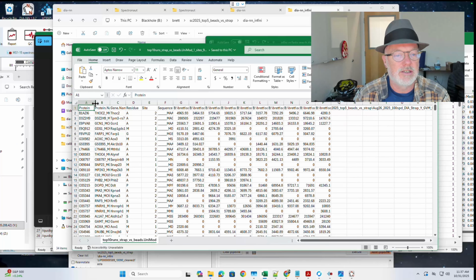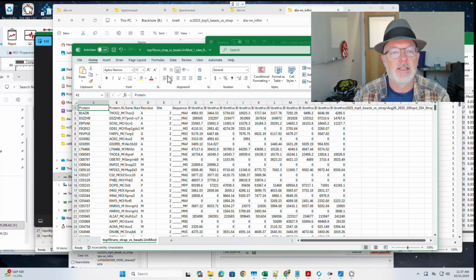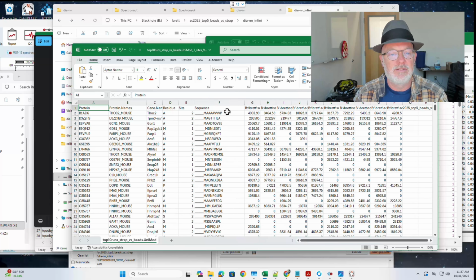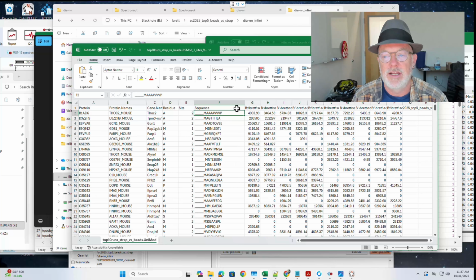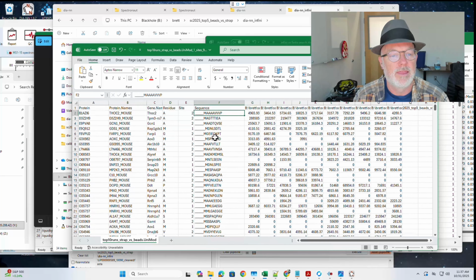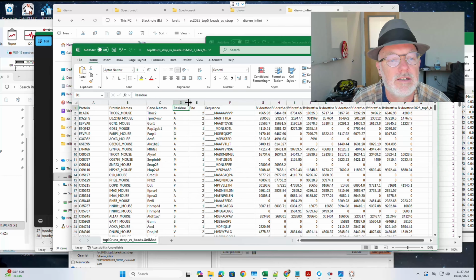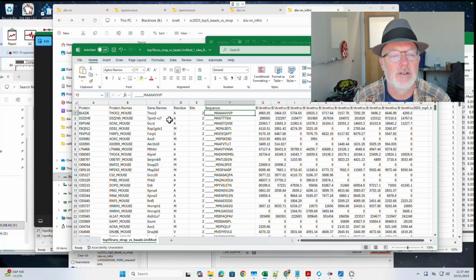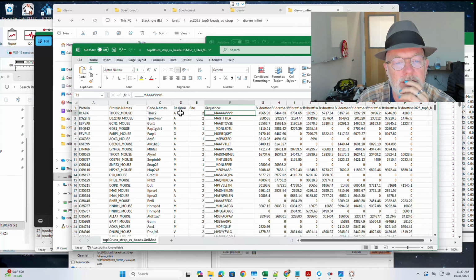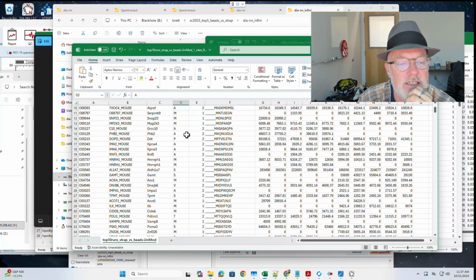So anyway, here's the protein, and these are all the proteins and peptides that have that acetylated modification. You can see it's here, residue. So this is the residue, I guess. But which residue? I don't know. That's interesting. Site 2. So there we go. Residue, alanine, site 2. So it would be this one. All right. That's kind of neat.